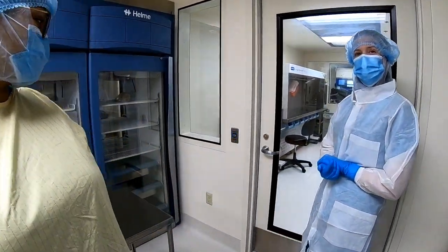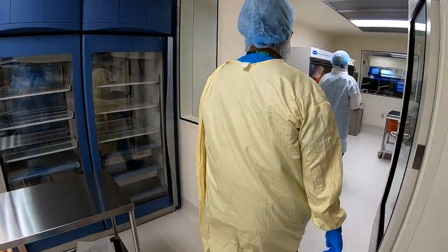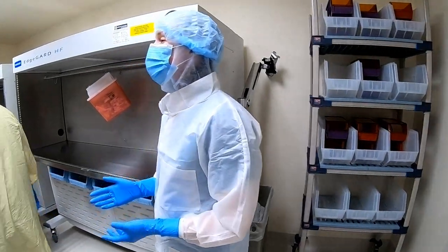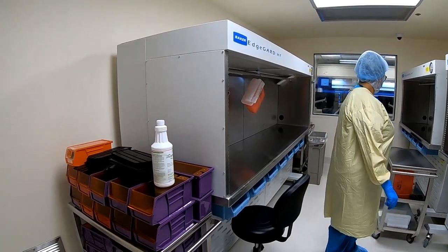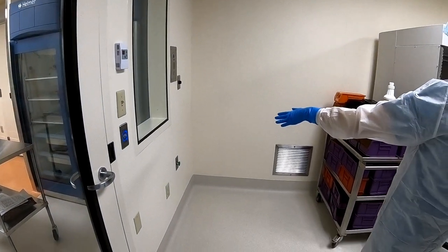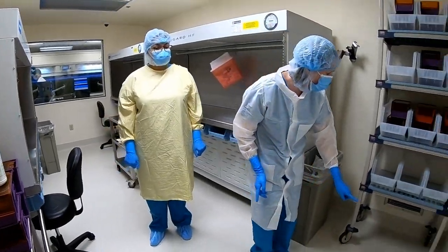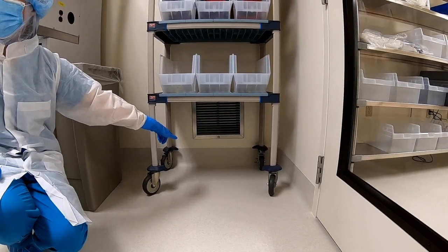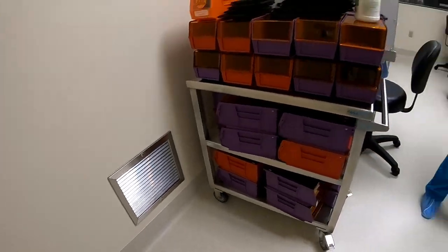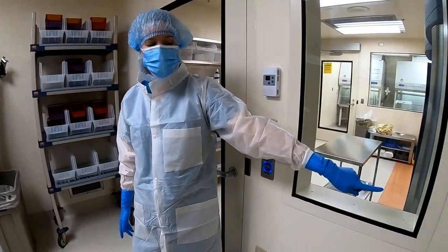There is not a lot of space in this IV room, so it's really going to be a change of pace and mindset — you need to be aware of your surroundings. There's no part cart yet, but this is where a med card will be for placing medications. A very important aspect of this IV room is the location of the air returns — these air returns cannot be blocked. We have limited real estate in here, so even if a shelf is in front of one, we cannot put bins in front of the shelf; it needs to be free and clear for air to be returned and not recirculating through the room. The intercom for this room is right over here.